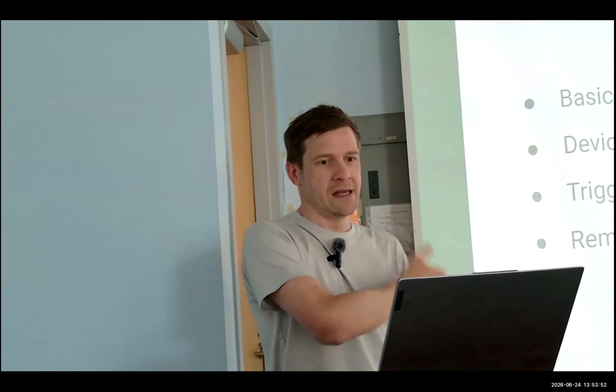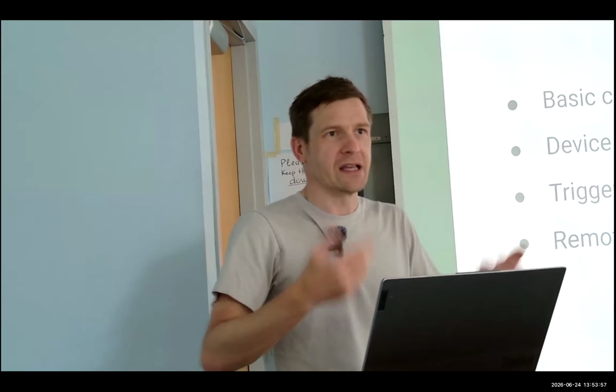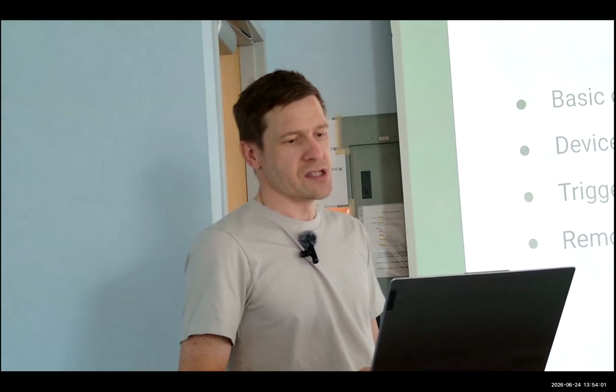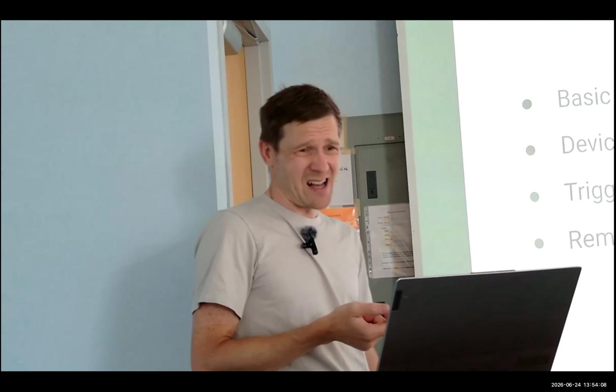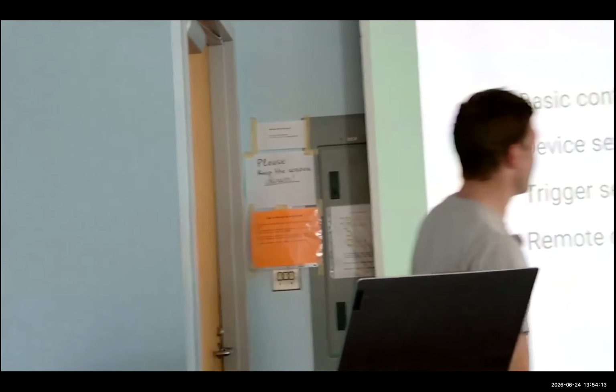And the last thing I wanted to go over, I have a couple of slides here, because I am leaving the instrument here. So I just wanted to give enough of an overview that you feel like you can jump on and have a go, basically. So we'll get this set up here, but really it's the microscope app in our Zaber Launcher software.